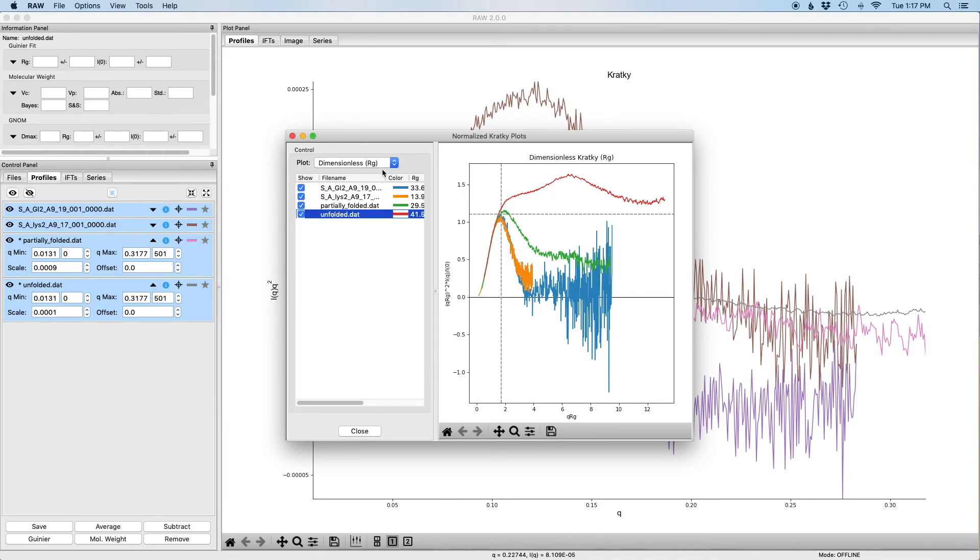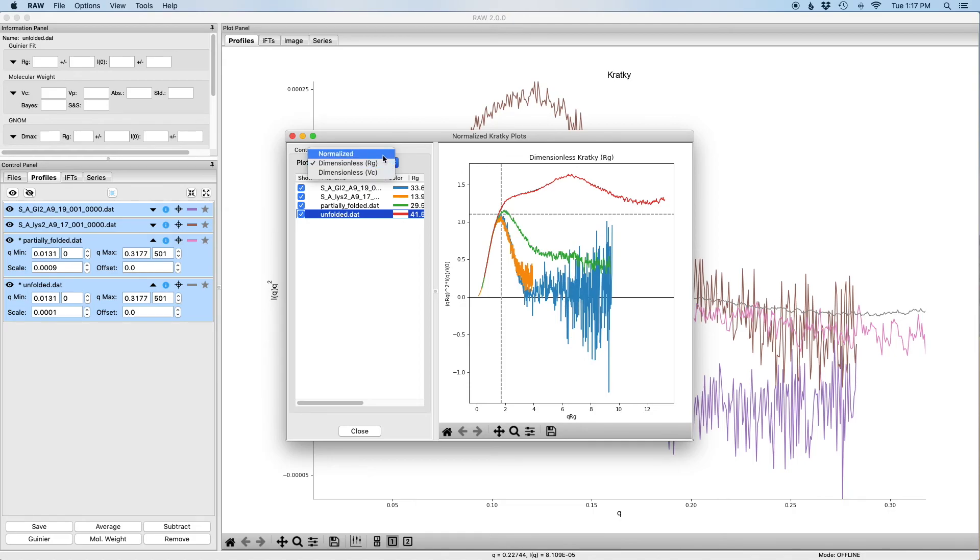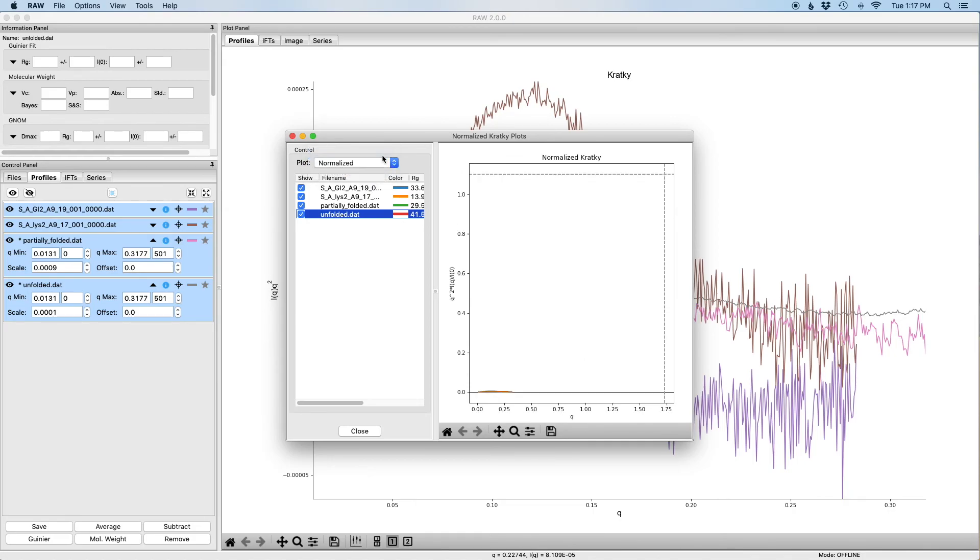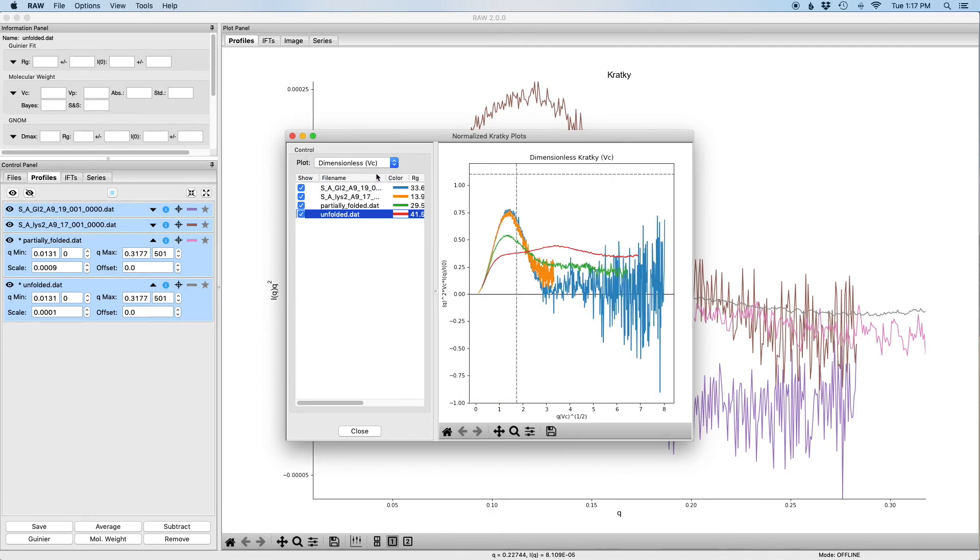There are several different ways you can display normalized Kratky or dimensionless Kratky plots. If you click on the tab here, we can change to normalized, which is just dividing by I of zero. We can change to dimensionless with volume of correlation, which is essentially doing what the rg does except with the volume of correlation. And then we can go back to dimensionless with rg.